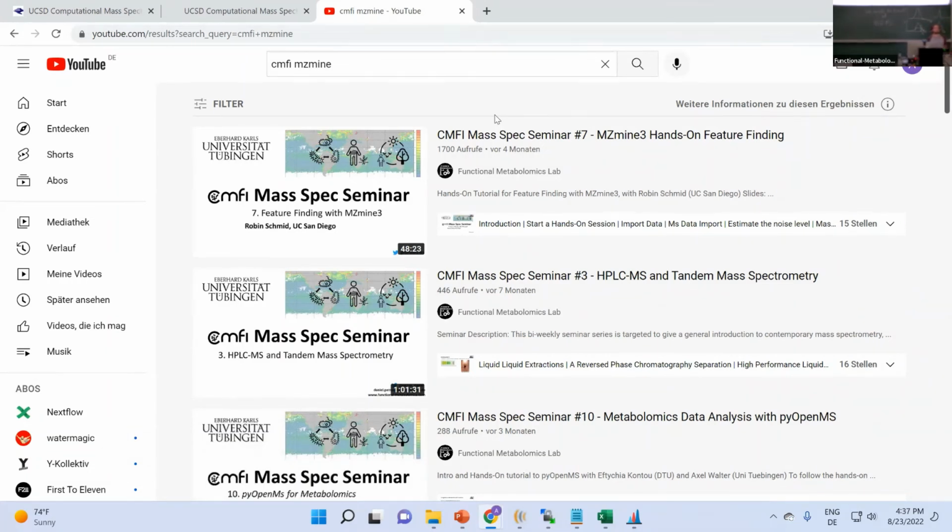The question is, I'm not an expert in statistical analysis. What's the best thing to do there to keep them? Because if you remove it, you have no information on the blank features whatsoever. So I think for statistical evaluation afterwards, it might be better to keep it in there and just cross everything together. But there is the option, yes. And we're also going to look at that downstream.